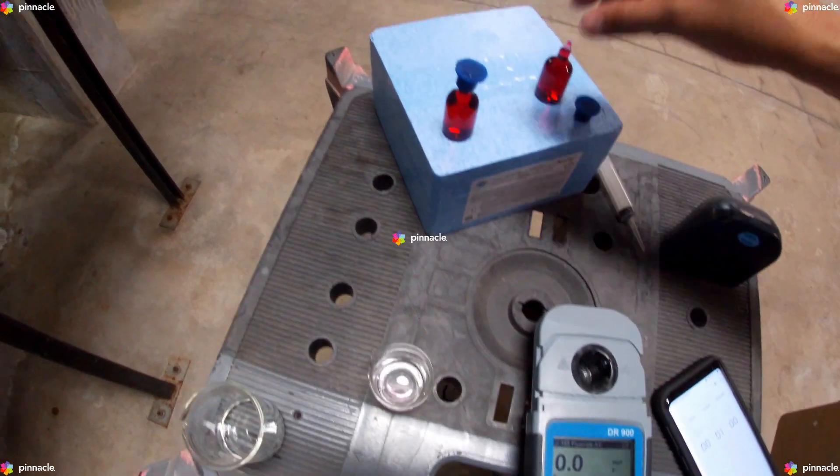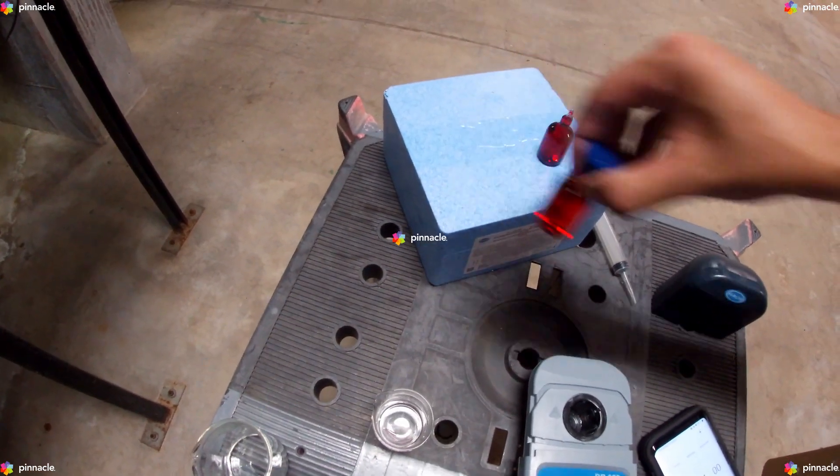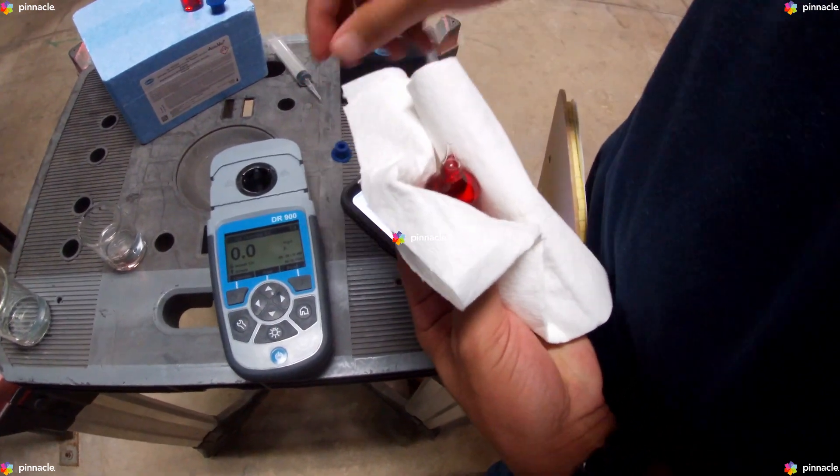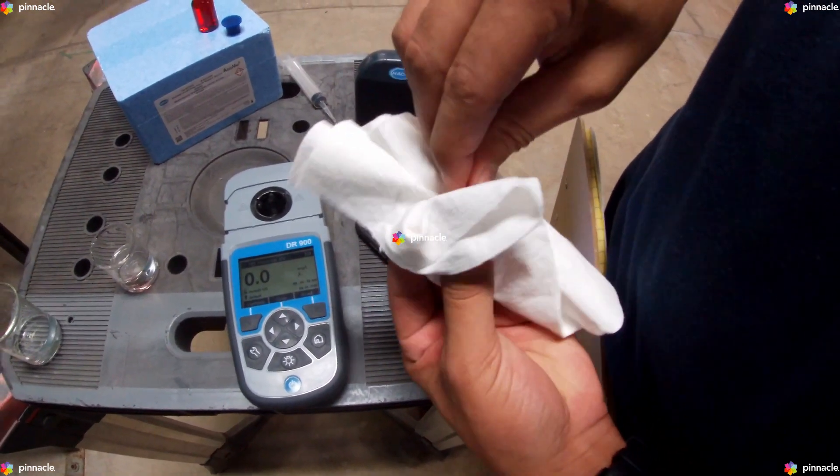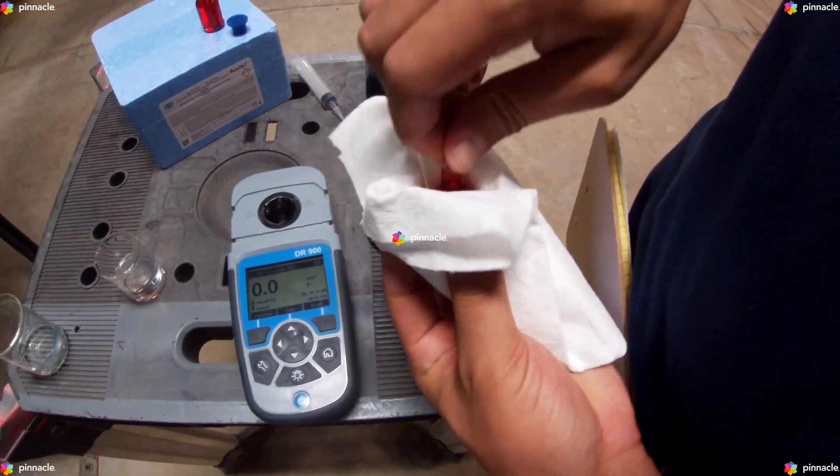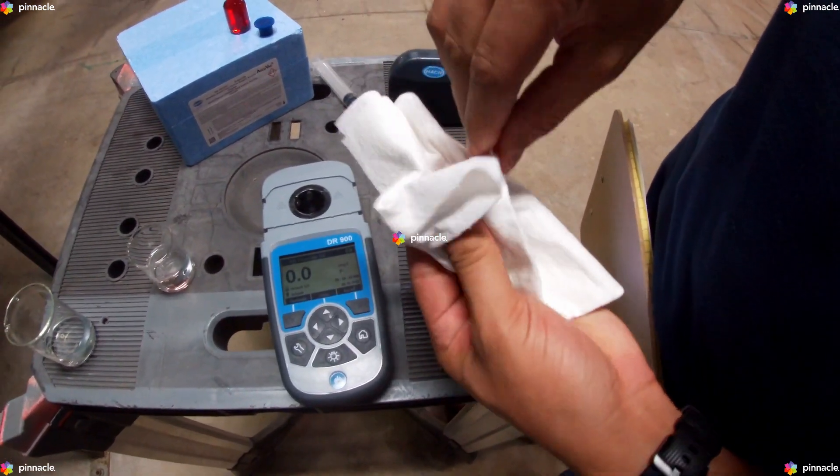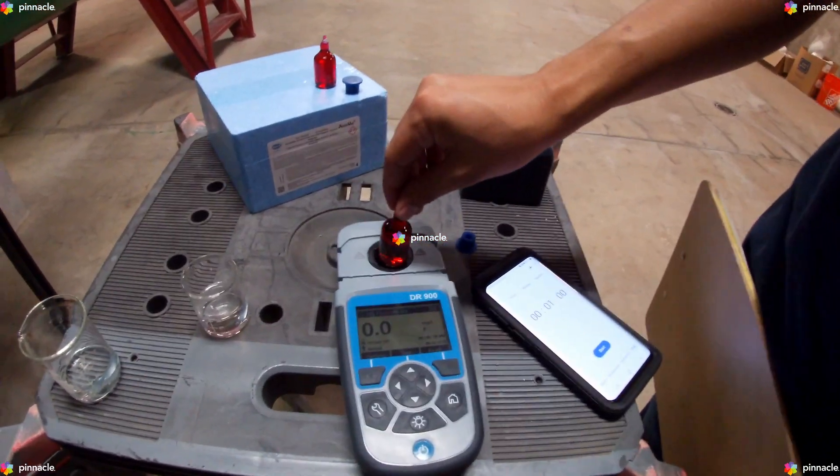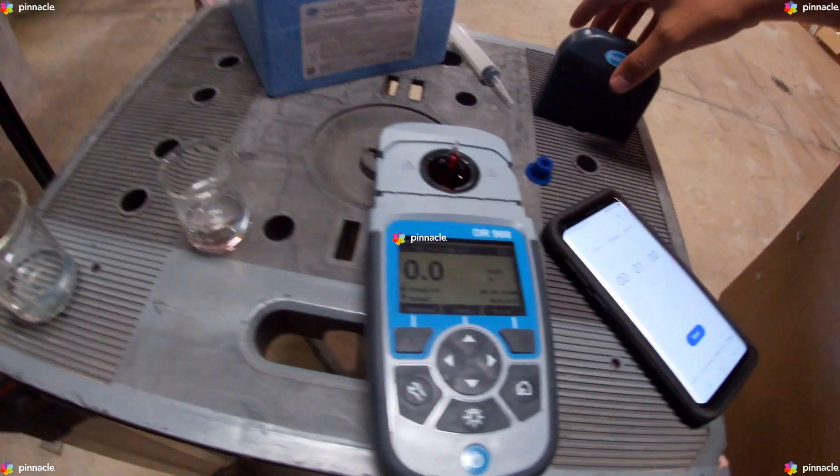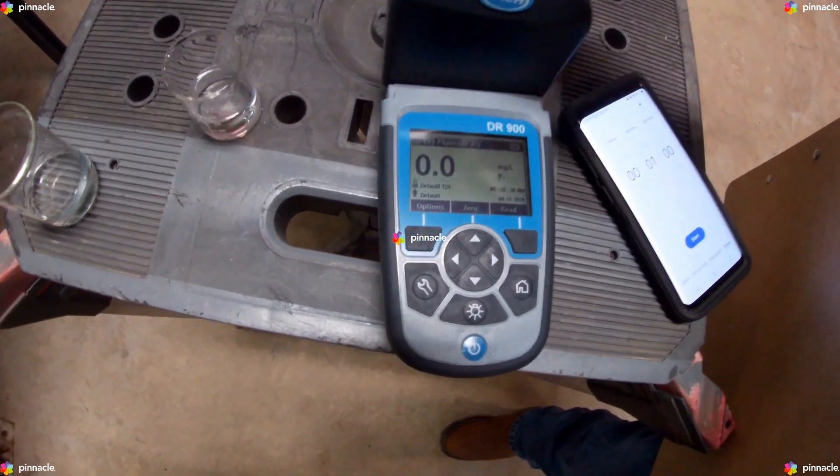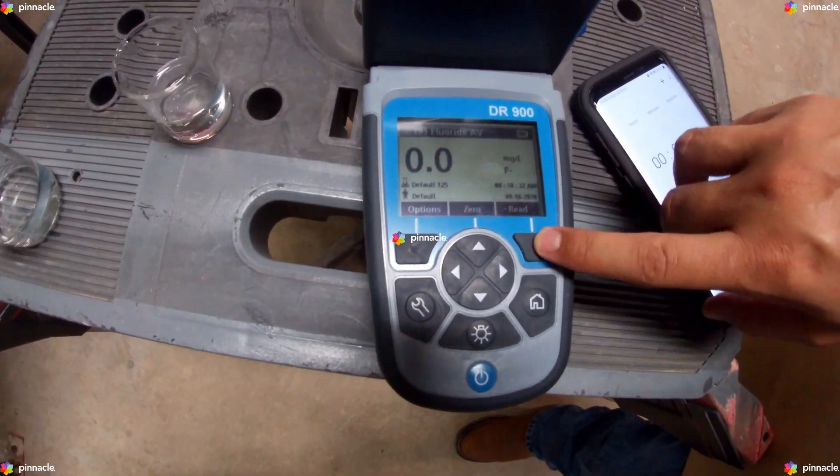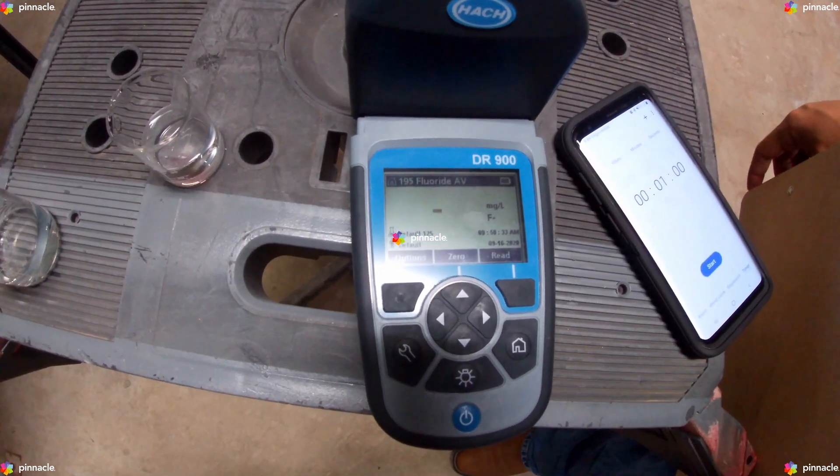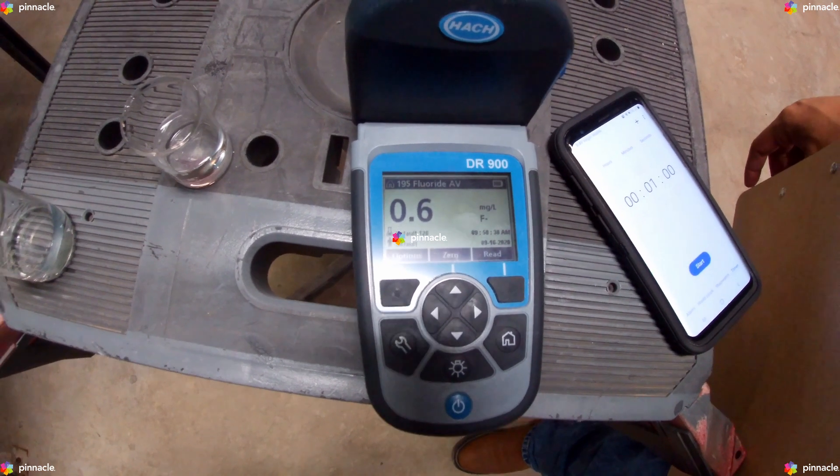We will then grab our sample AccuVac Ampoule and thoroughly clean it. We will then insert the prepared sample AccuVac Ampoule into the cell holder of our DR900 pocket colorimeter and press read. The results are shown in mg per liter of fluoride.